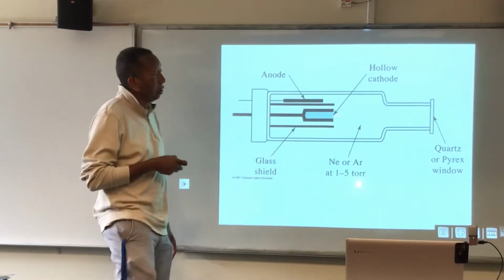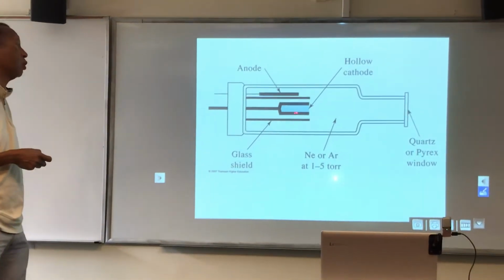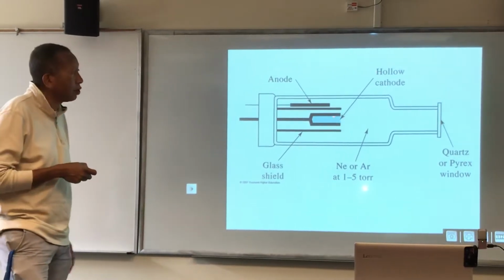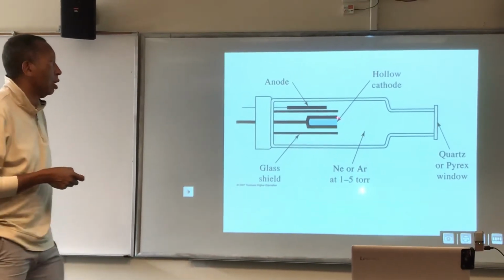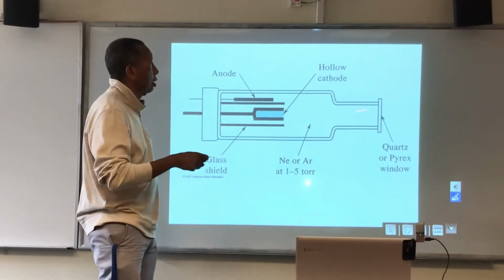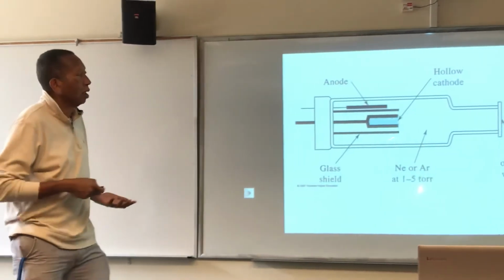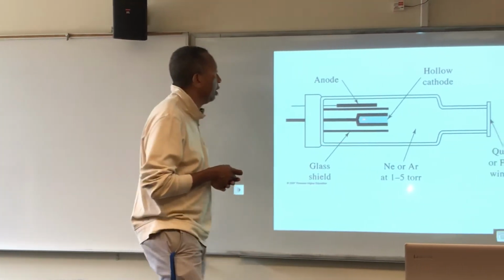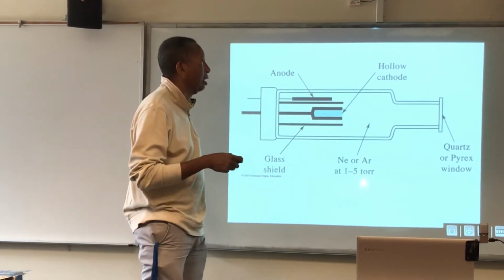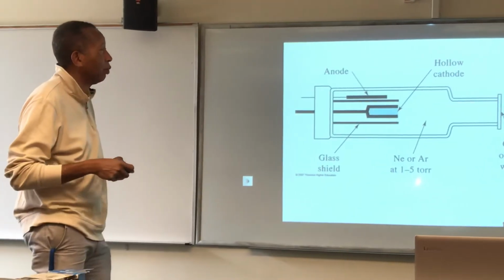All right? And in this atomic cloud, we have enough energy to excite molecules from the ground state to the excited state. And when they get to the excited state, they return to the ground state and release radiation, and the radiation goes across here. Now notice it's cylindrical, and it's cylindrical for a reason. That means it focuses all of the radiation that's produced out in that direction. So the radiation has a narrow line. It's a very narrow line.